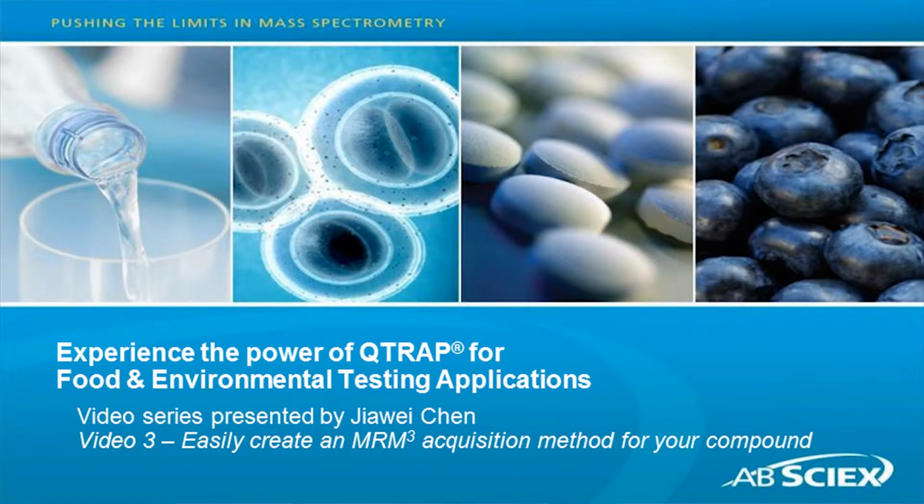Welcome back to our video series about MRM cubed workflows for residue quantitation. We've given you some background on the benefits of using MRM cubed. Now we want to show you how you can easily upgrade your MRM acquisition method to capture MRM cubed data for your compound.